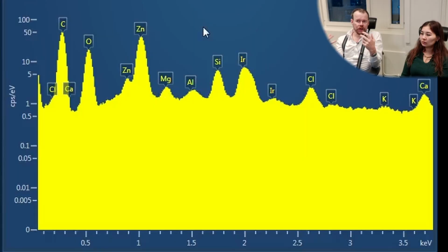On the old detectors, process time had some kind of significance in this. You actually improved the resolution energy-wise by changing process time. On the modern silicon drift detectors, there is very, very little change. I mean, the width of the peak is larger than the benefit when you change that process time.